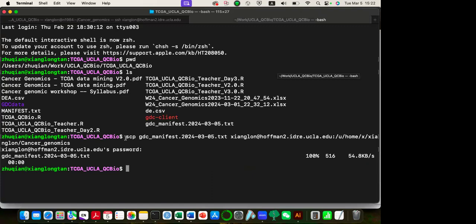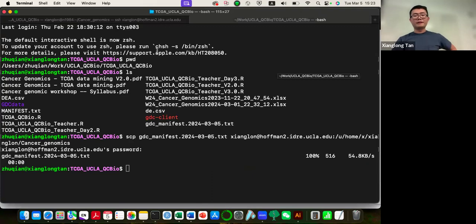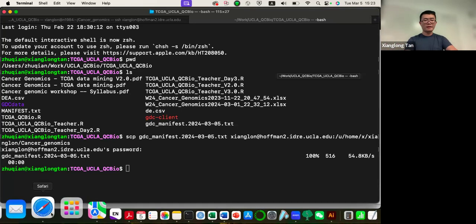I have a question. For the manifest file, could I see just real quickly if I got the right ones? I'm sorry, you're breaking up a little, but I've seen your question. So it's the manifest that we're loading for the three files. Yes. Those manifest files are from the three files in the cart. We just added those.